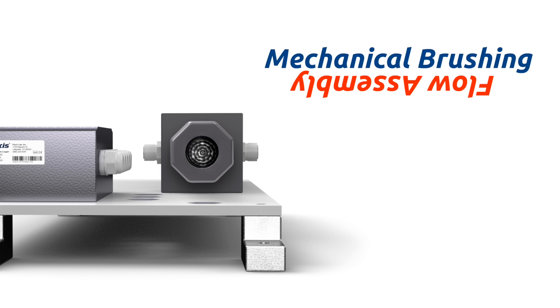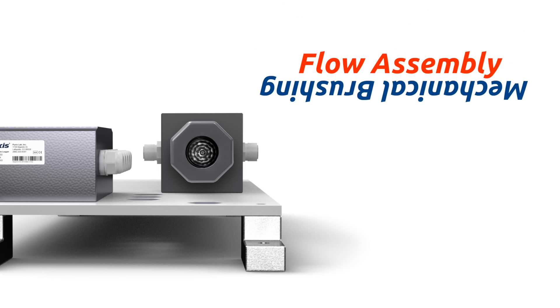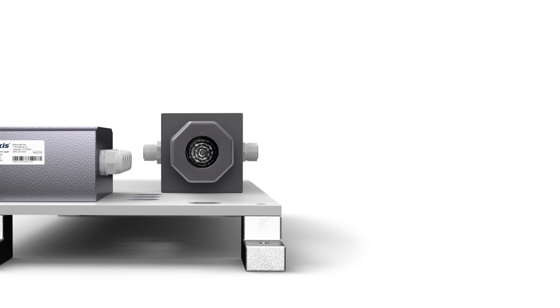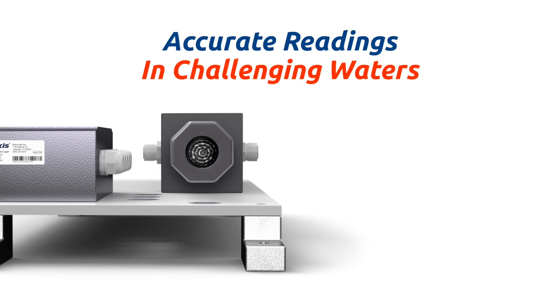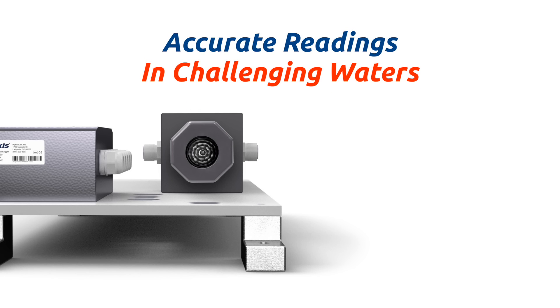Each OxyPanel is also equipped with the FR300 Plus mechanical brushing flow assembly to ensure constant electrode cleanliness. The FR300 Plus was designed with a magnetic coupling motorized brush assembly that provides inline mechanical cleaning of the ST765 bare-gold electrode, resulting in unmatched sensor accuracy in challenging industrial, cooling, and process waters.